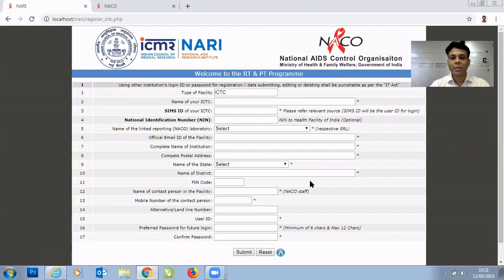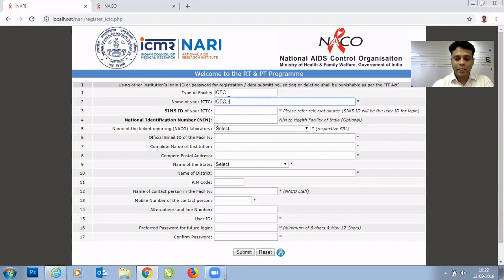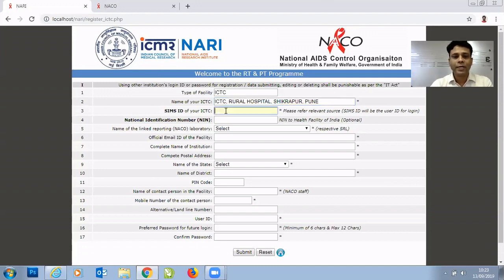Registration is a one-time activity. You need to register first to obtain a user ID and password. The type of facility is already selected as ICTC since we clicked on that tab. Next, type the name of your facility, for example, ICTC Rural Hospital. The next field is the SIMS ID — every ICTC is provided with a SIMS ID used for accessing the SIMS software. Type that SIMS ID in this field.